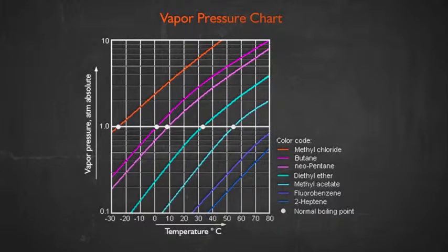And as you decrease the pressure further, more and more of the different compounds will come off. But if you do this carefully and you somehow are able to collect the volatile compounds, the gas that you have, and reconvert it into a liquid, then that will allow you to separate the different compounds. So with that in mind, let's go back to the Rotovap, to this big clunkety-looking machine that Johann Roca was showing you, and let's talk about the different pieces and about how they work.